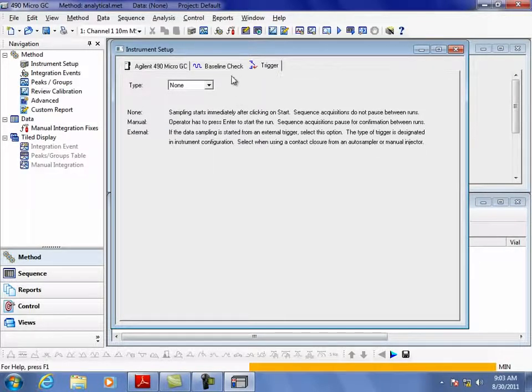Okay. Right? So we were wondering because right now the sample injection here is done manually because we don't connect it to the gasifier yet. So you have a gasifier? Yes. The gasifier is not the one you define as gasifier from Agilent. And our gasifier generates CO and hydrogen. It's not the vapor. Oh, your gasifier in your process. I'm sorry. But basically, this is not completely the same thing at this moment. So the first attempt we want is to use a syringe and then inject that sample.